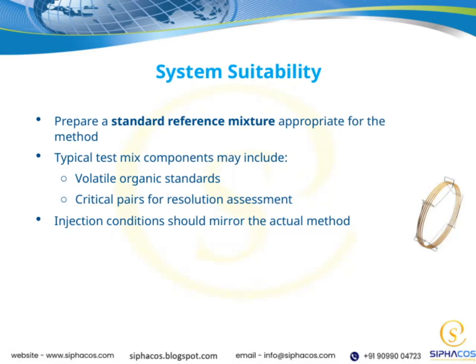Now, let's talk about system suitability. This is a critical step to ensure our method is performing as expected before we proceed with analyzing real samples. First, we need to prepare a standard reference mixture that's appropriate for the specific method we're using. This mixture serves as our benchmark.